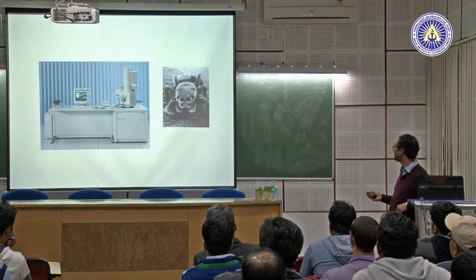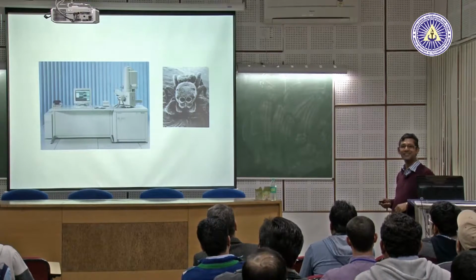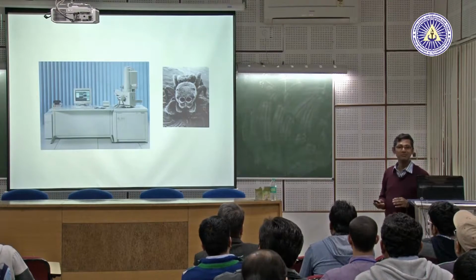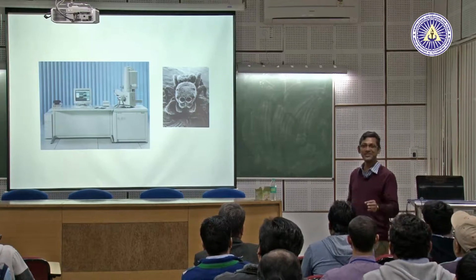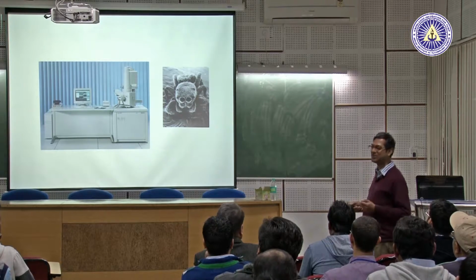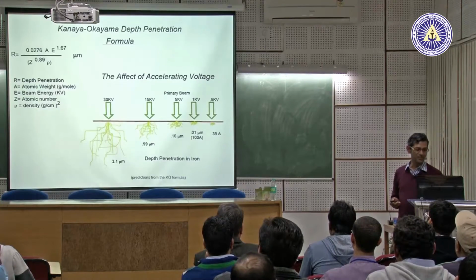Yes, these are the eyes of a spider. Have you ever seen inside it? How many eyes do they have? So this is the first sample your instructor will show you the first time you go to this SEM. Very easy to see, very easy to focus. Sometimes they show some insect, other insects also.